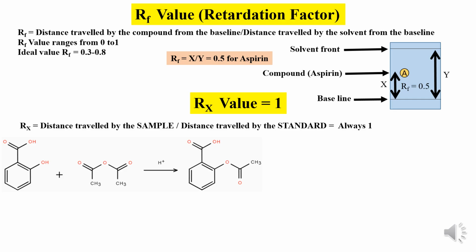After a refluxing period of 30 minutes, you cool the reaction mixture and pour it into ice cold water with constant stirring, whereupon the aspirin precipitates or separates as a solid, that is filtered and washed with water. So wash with copious amounts of ice cold water in order to remove the excess of unreacted sulfuric acid.